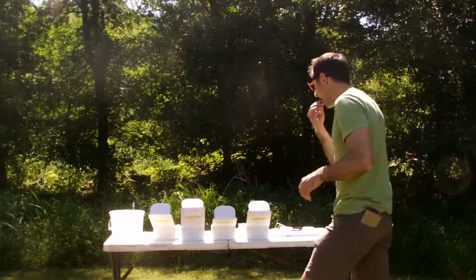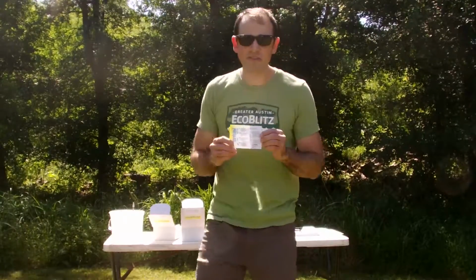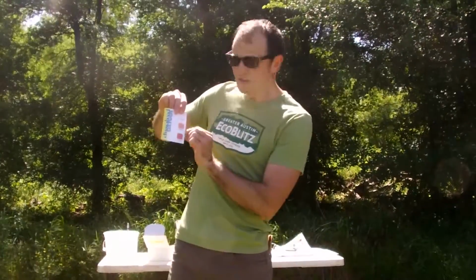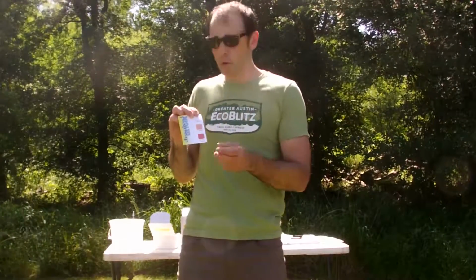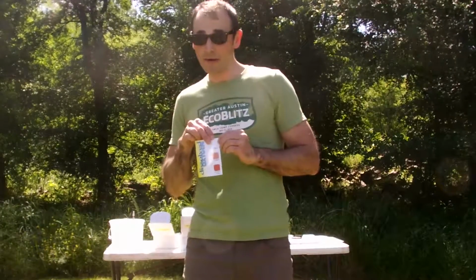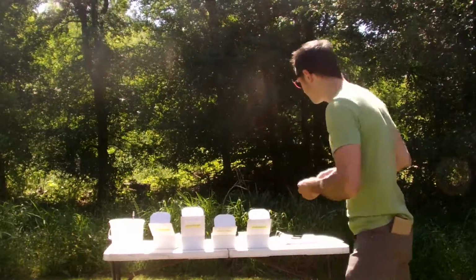One of the great things that you have is this little wonderful chart right here, which gives you instructions on how to do it. Now each kid will have this because it'll be in their workbook. You'll have the nice little laminated copy. And on the back side is the color chart. So this is measured in ppm, which stands for parts per million. And that's how they record it. So it's either going to be an 8, it's going to be 4, or it's going to be a 0, all right? We're hoping to be somewhere around 2, maybe 3, which would be great.